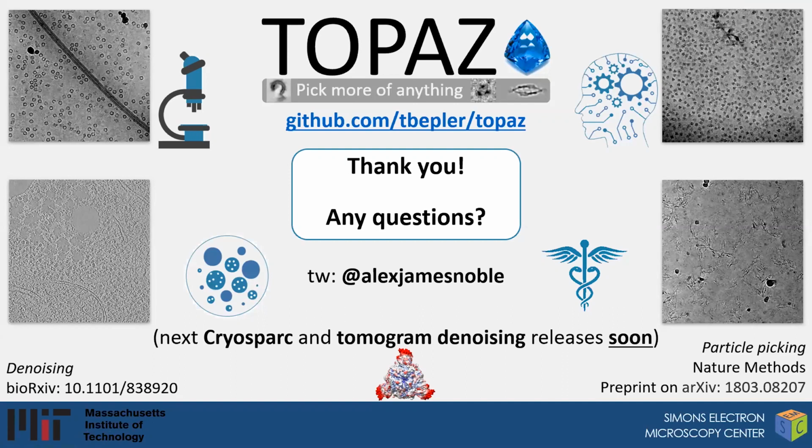Okay, thanks very much, Alex. So again, lots of questions. I'll try to pick a few. So from Michael Sauer, could you explain in more detail how the neural network works differently between Topaz and Cryolo and Warp?